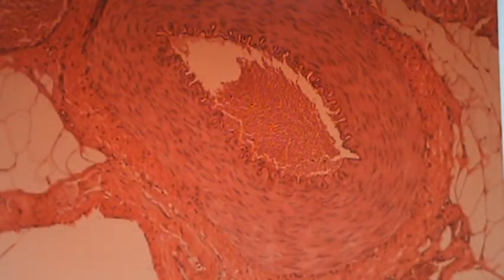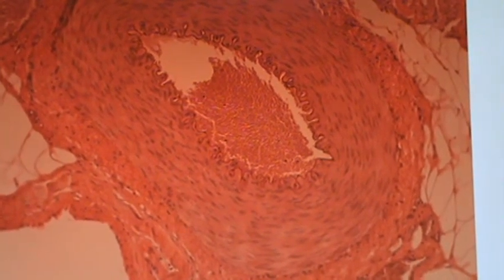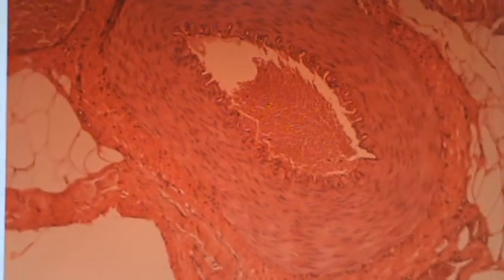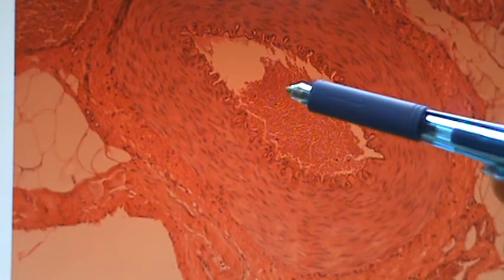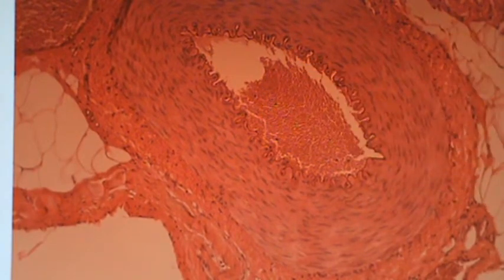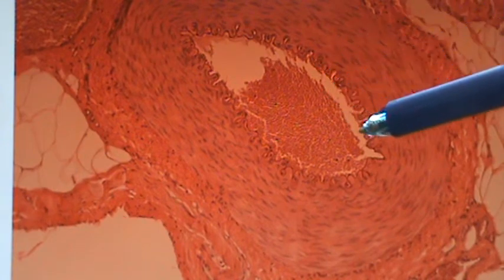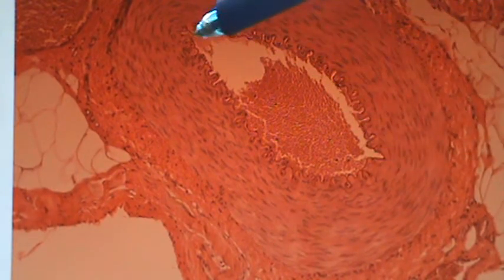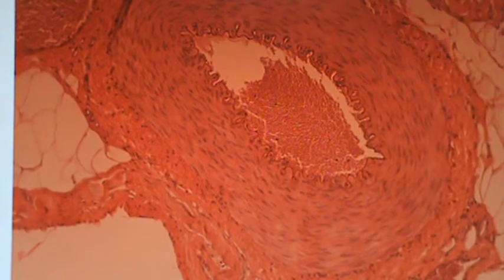Okay, here we are back with an artery again. So let's do it again. Let's see if you can see all the different parts here. Number one, in the middle, right there, is going to be the blood. So that's connective tissue, and the specific type is blood. And again, along the edge, this whole edge, is the simple squamous. Epithelial is the major type; the specific type is simple squamous.